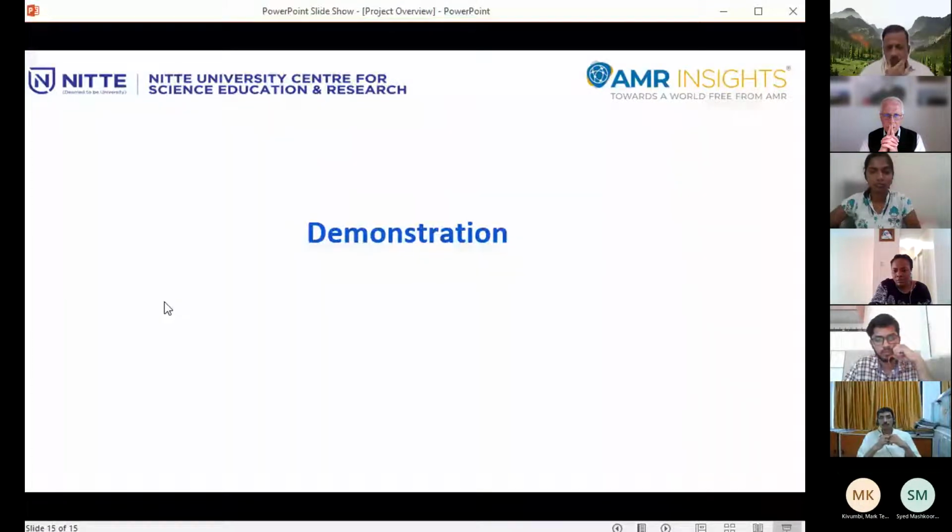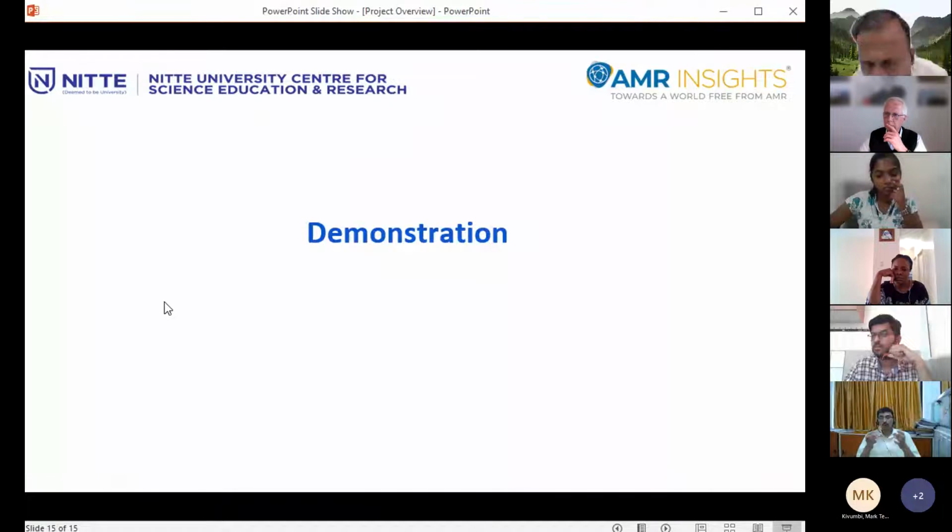And those data we will be importing to the Galaxy tool, and in Galaxy tool we are going to select different tools which are helping to mine antibiotic determinants. We will be knowing how to run or execute these tools, and once the execution is done, how to retrieve the result. So this is the part we are going to cover in today's demonstration. With this small introductory remarks on the handbook, I'm requesting Prithvi Sagar to demonstrate the different tools.